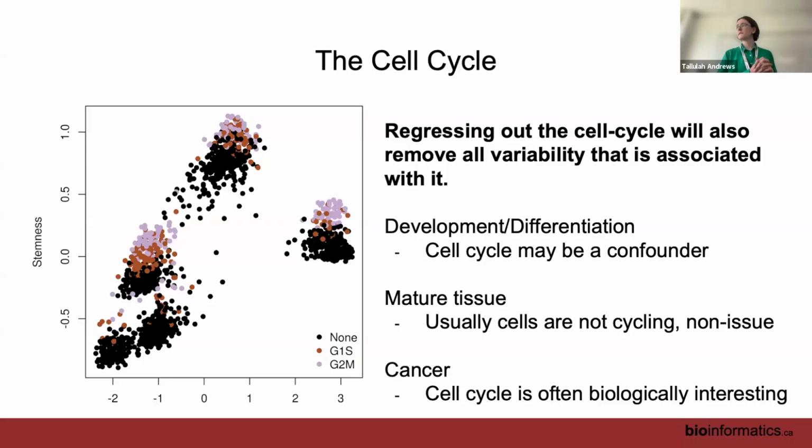Before we move on too far, I just want to make sure this question gets answered. By using smaller subsets, does the central limit theorem apply? The central limit theorem does not apply because the central limit theorem is talking about averages most of the time. It can also be talking about sums, but in general for our single cell RNA-seq data, the central limit theorem doesn't apply because our data follows a negative binomial distribution.